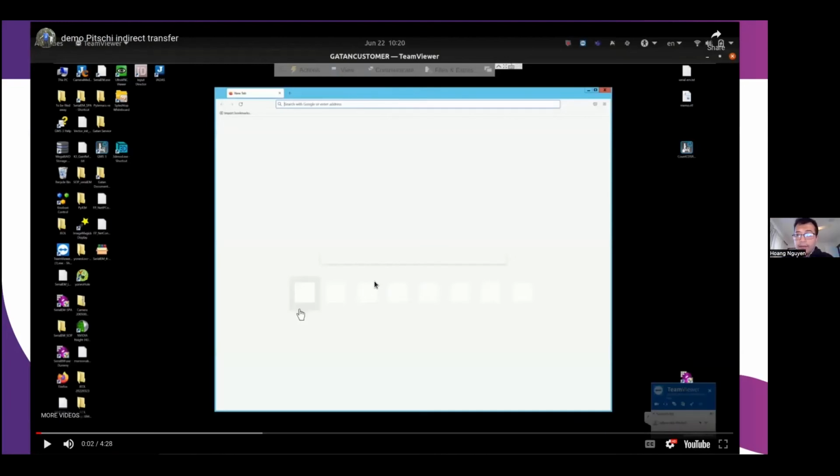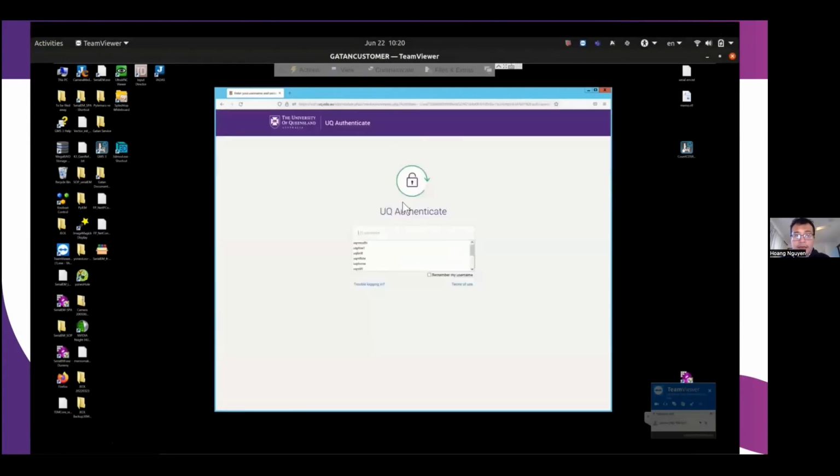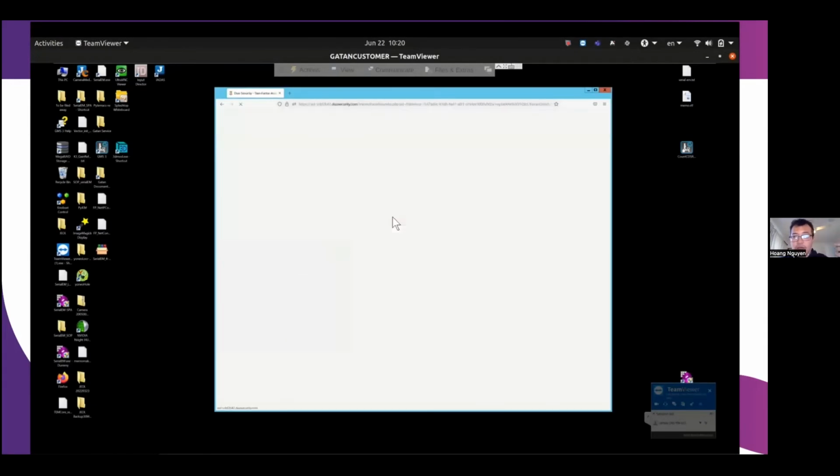So instead of logging into the tracker program, in this one, the user goes from the camera machine. The user actually goes into a website that is hosted in the data transfer node, and they need to log in using AF. And then once they've logged in, they can start the experiment.